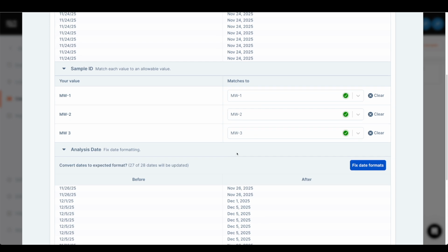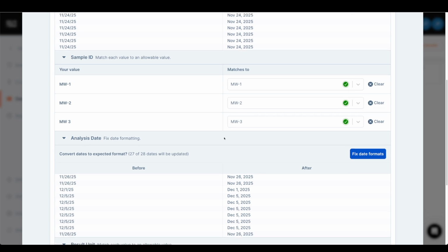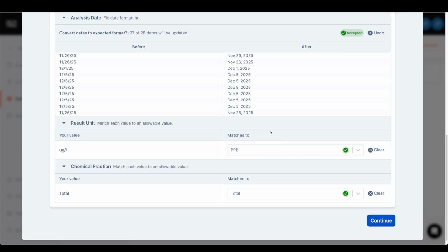And this is going to make it media agnostic in the sense that I can have a soil location in my lab file as well, and if I have soil locations in my project, it'll connect those locations to each sample location name. It's not uploading it via media specific or matrix specific, it's uploading it by sample location names. And that's how it's connecting that data.